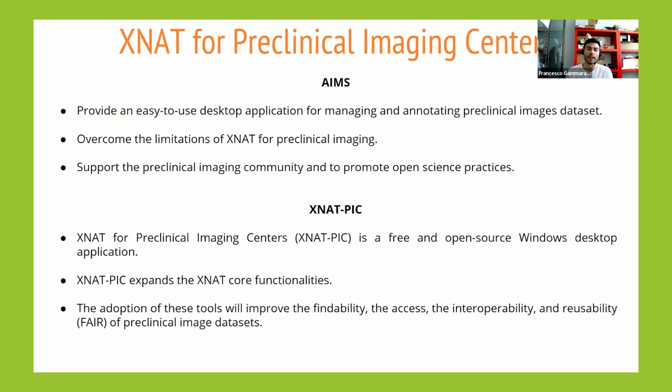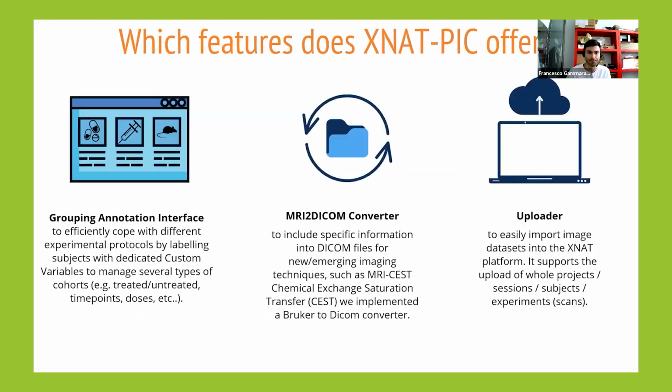And we want to overcome the limitations of XNAT for preclinical imaging. So we have developed XNAT-PIC, that stands for XNAT for Preclinical Imaging Centers. That is a free and open source Windows desktop application. The features that XNAT-PIC offers are a grouping annotation interface, that is a dedicated interface to edit the custom variables for your project.